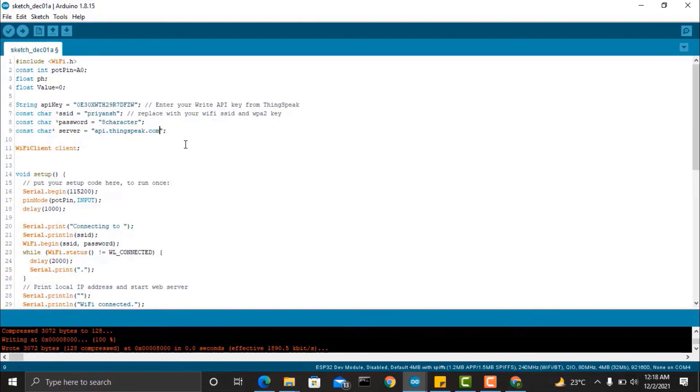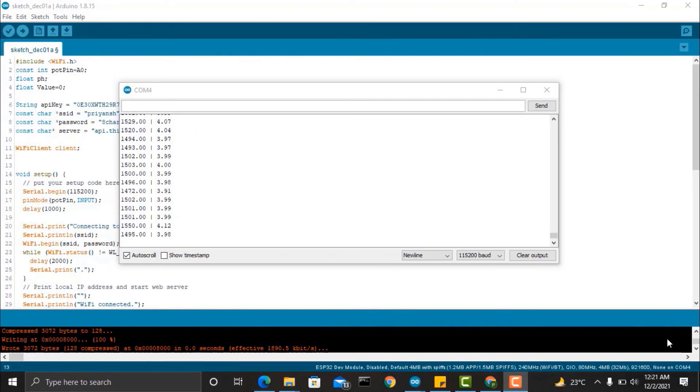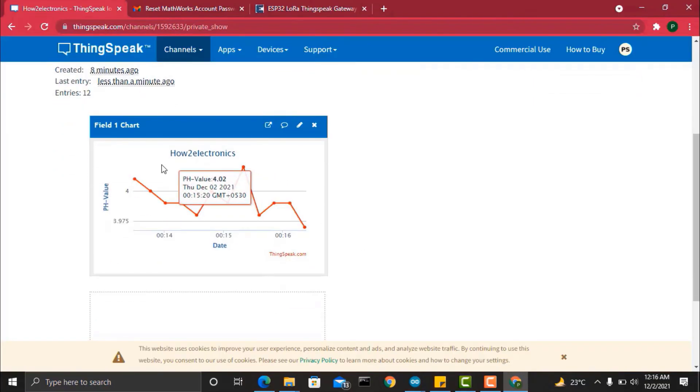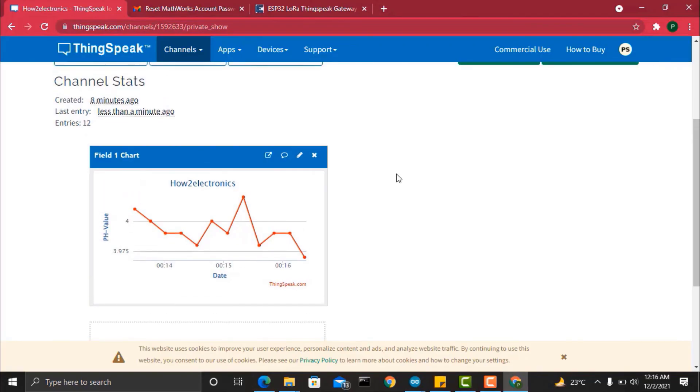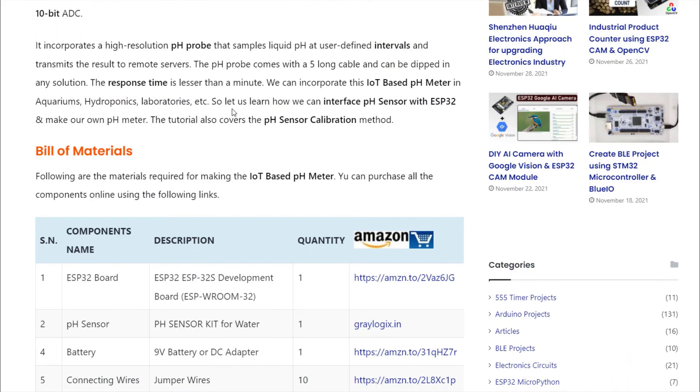The rest of the thing doesn't need any changes. So after uploading the code, the serial monitor still shows the value of pH of lemon. Now move to the ThingSpeak dashboard and go to the private view of your channel. So here you can see the pH value being uploaded on the ThingSpeak dashboard in graphical format. So this is how you can monitor the pH of any liquid online from any part of the world.